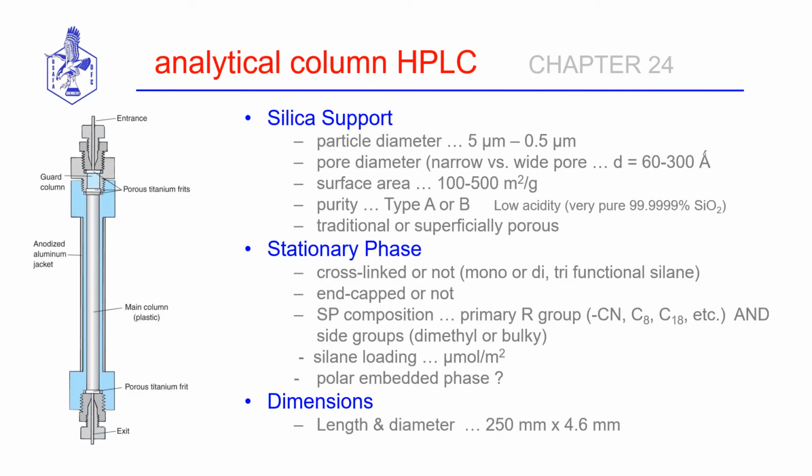It is said that the heart of an HPLC instrument is the analytical column. That is where the actual separation occurs, where our sample components are exposed to the two different chemical environments, the mobile phase and the stationary phase. The analytical column is something that gets purchased from a number of vendors, and a typical column, traditional length and inner diameter, etc., is going to cost you in the neighborhood of at least $400 and could be even more.